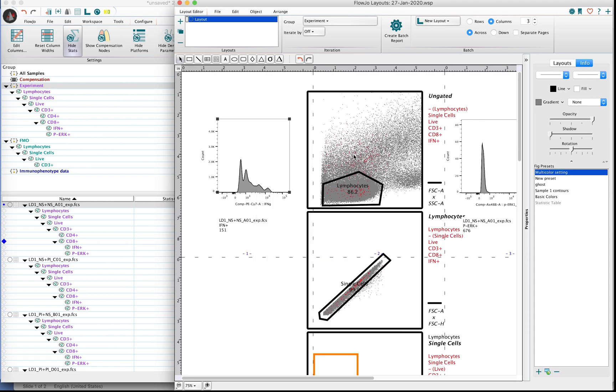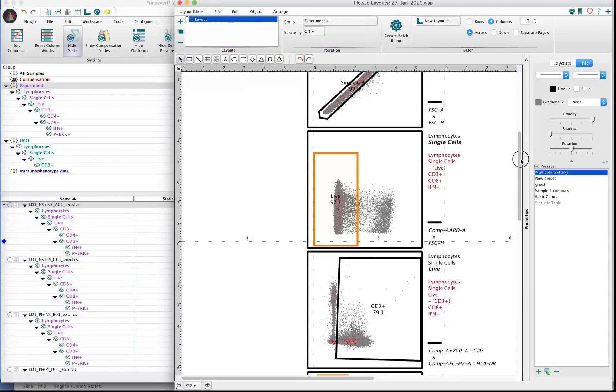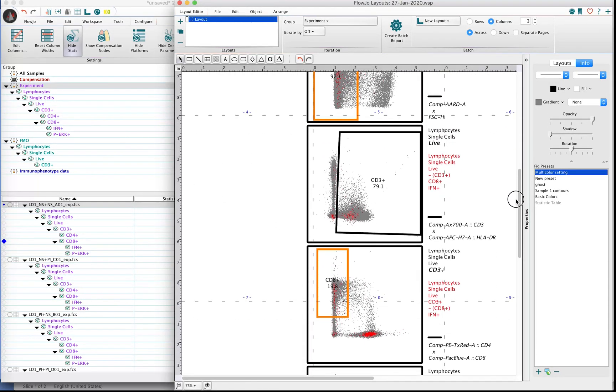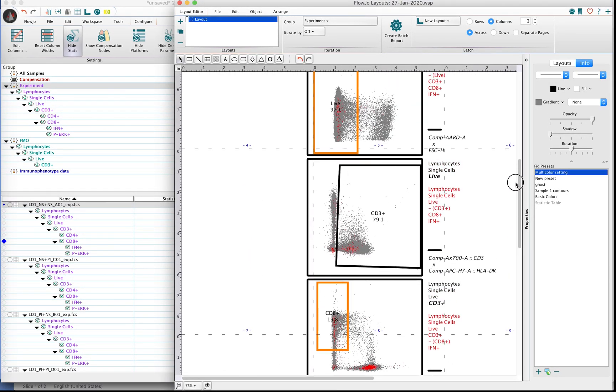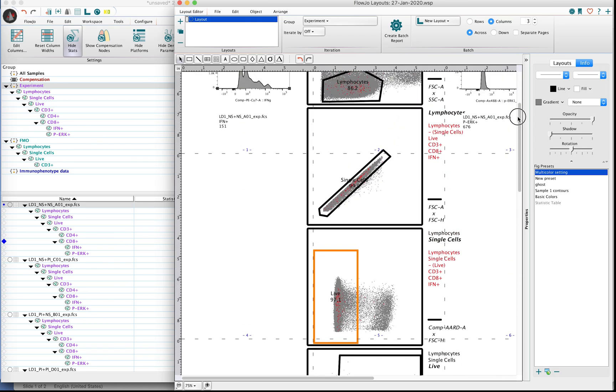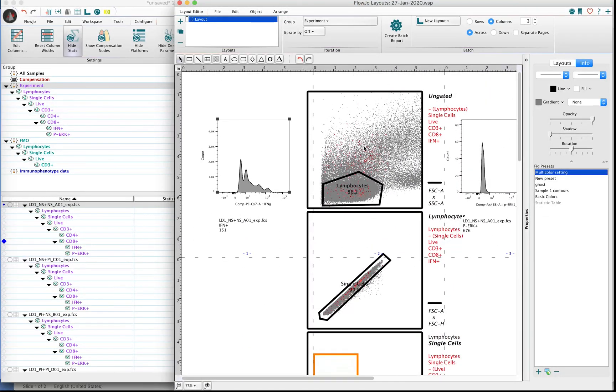This will give you a panel that looks very much like Ancestry in that there are a series of gates here, the same exact gates that led to the population that you're looking at in the end. However, you'll notice that the coloring is gray or red.